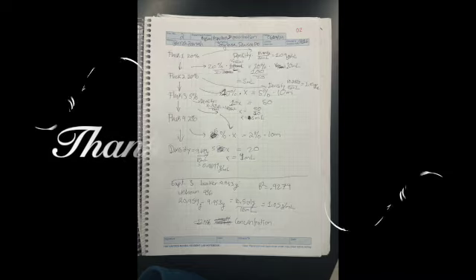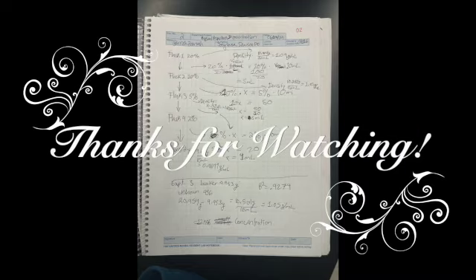So we created a calibration curve with sugar solutions from 20% stock to 10%, 5%, and 2%. And we determined the unknown concentration from the calibration curve. So you can find out what you need to make the concentrations from the stock solution by using concentration 1 times volume 1 equals concentration 2 times volume 2.